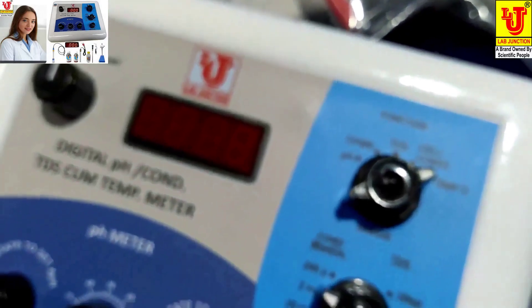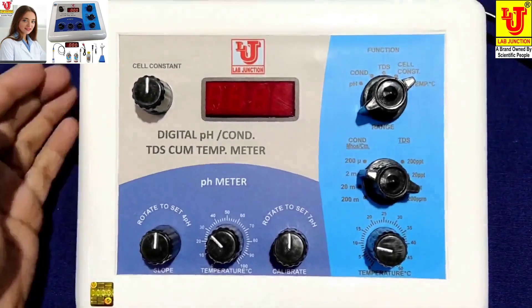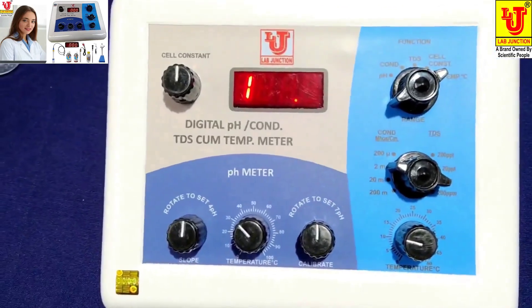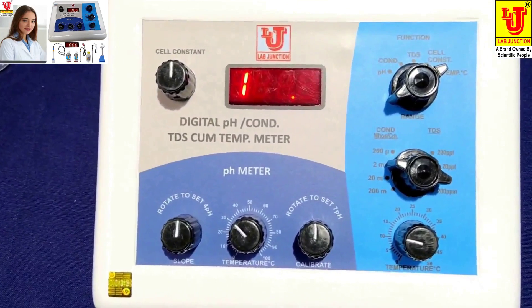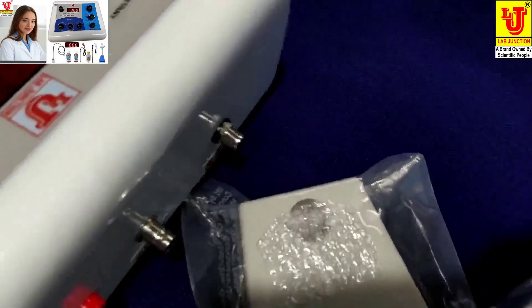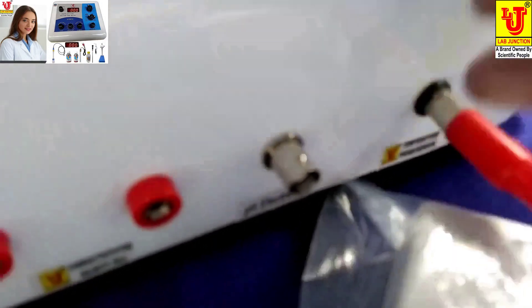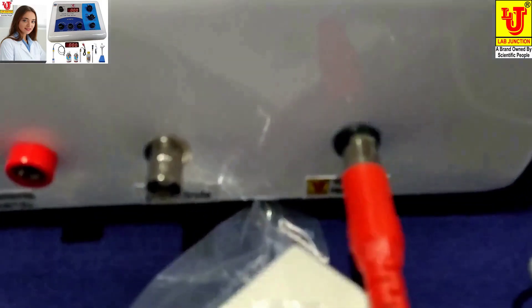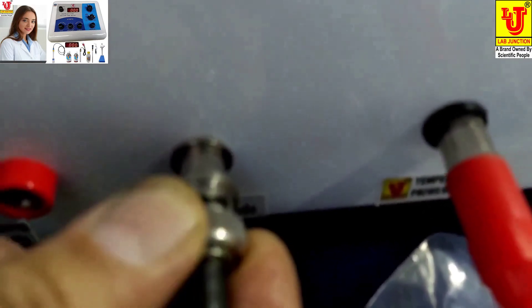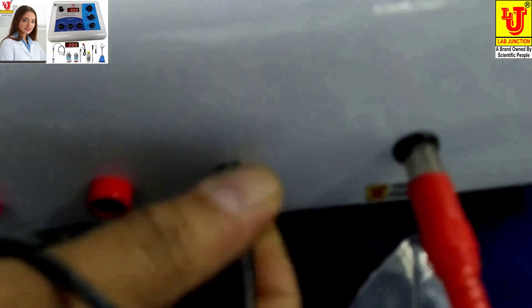Now, how to install and use this instrument. I am switching on the instrument. Now connecting sensors — this is the temperature sensor and this is the pH electrode. You have to just insert this and twist to lock it.